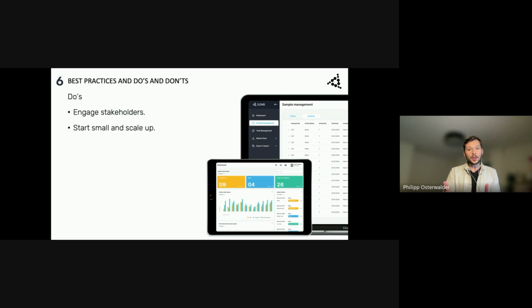But at the end, if you want to scale and have leverage, you have to standardize all the steps. Every working step and every small piece has to be in a standard operating procedure and has to be copy and pasted to gain the same result. These are the basics for scalability. Vendor support is also an important thing.